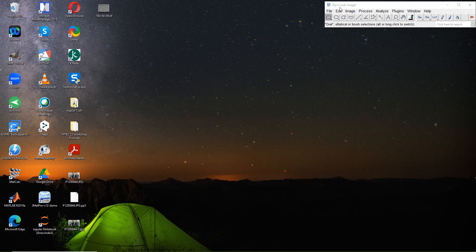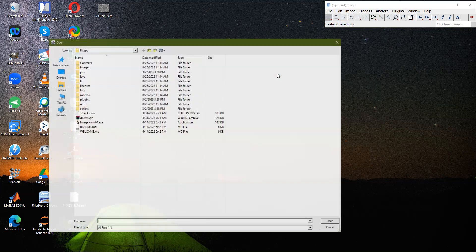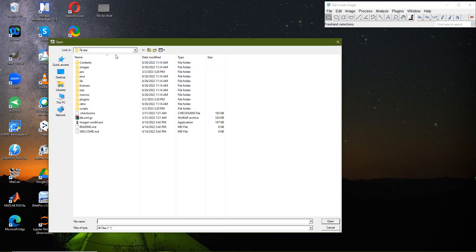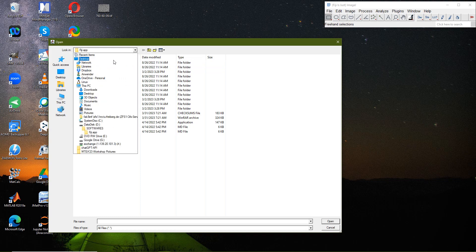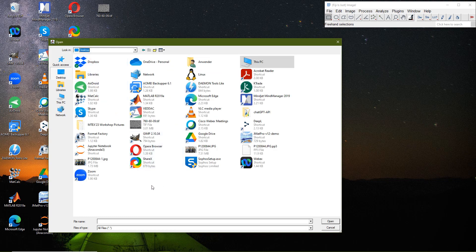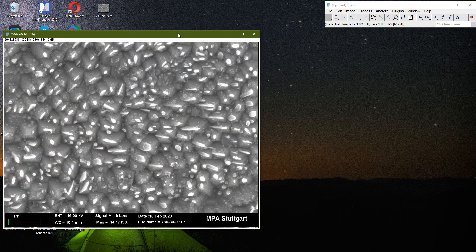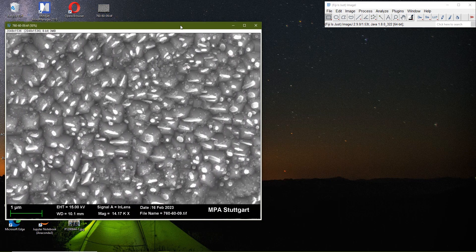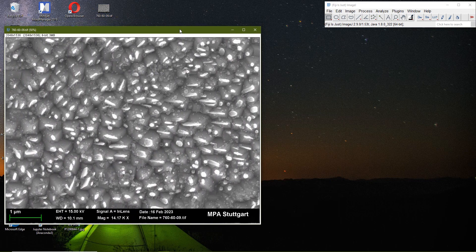When you run the program it will look something like this. I'll go to File > Open and navigate to the folder where I want to open a file — this is on my desktop. I'll select the file and it will open up like this.